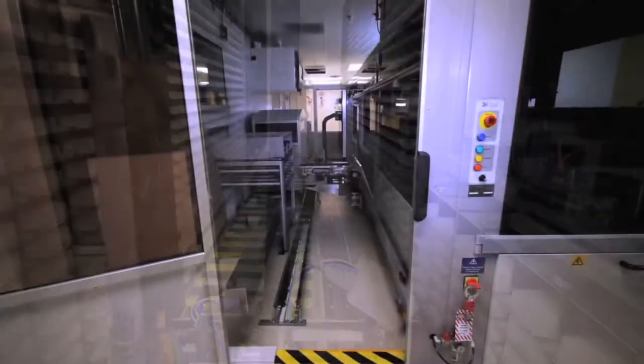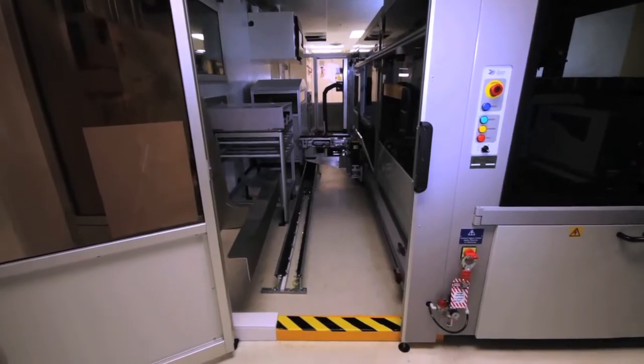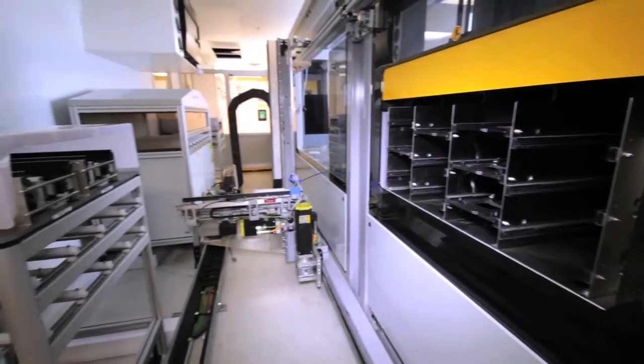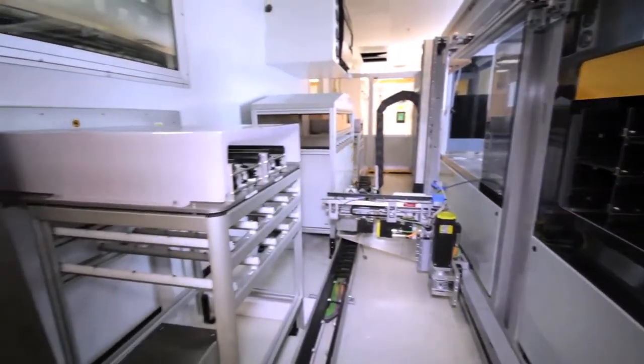The second robot is mounted in the ambient temperature aisle, transferring microplates or tube racks from their respective loading units to the buffers, awaiting loading into and from the freezer and the thawing cabinet.